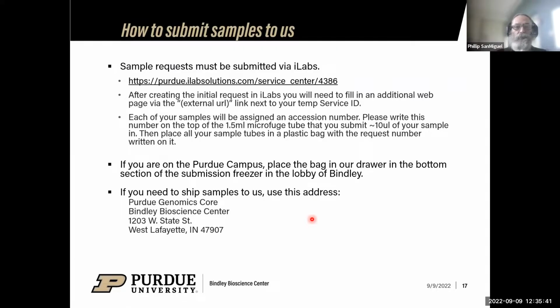Okay, so if you're convinced you want to submit samples to us, you can submit those samples via iLabs. If you want to go directly to our core, we're Service Center 4386, or you can search for us in iLabs if you know how to do that, or send me an email and I can send you the link.